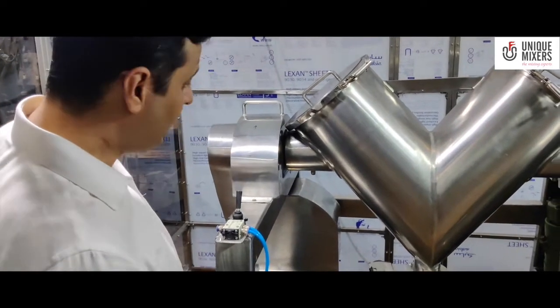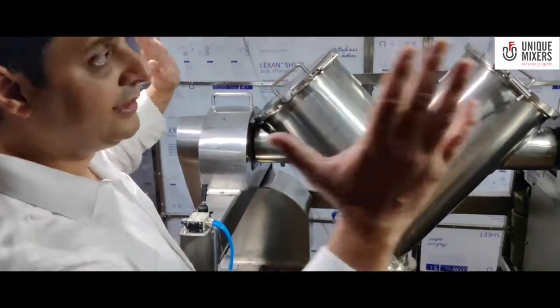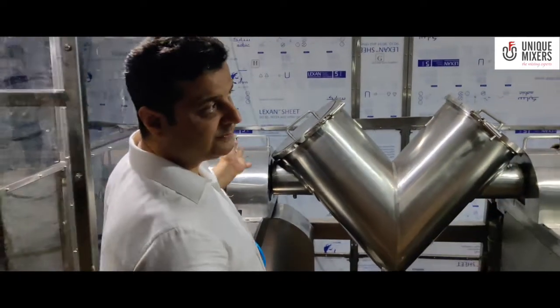So yeah, all in all a pneumatically actuated discharge valve. This safety enclosure that you see is basically for protection.